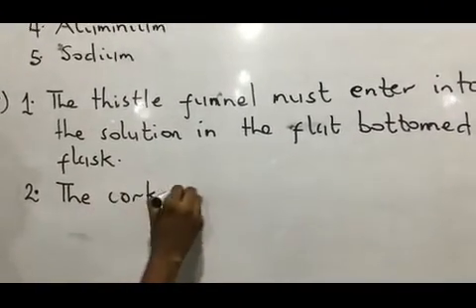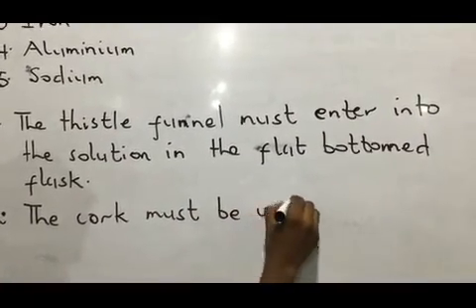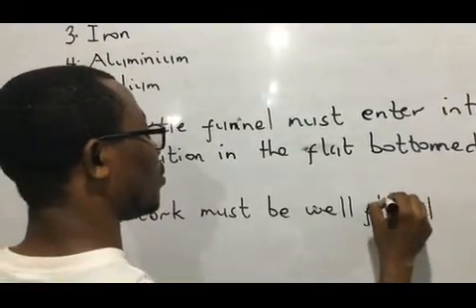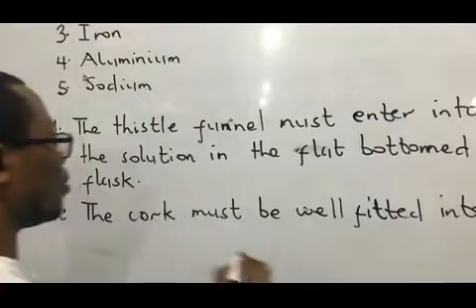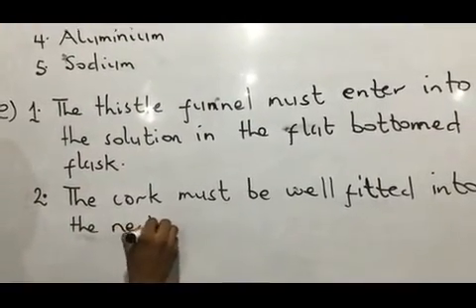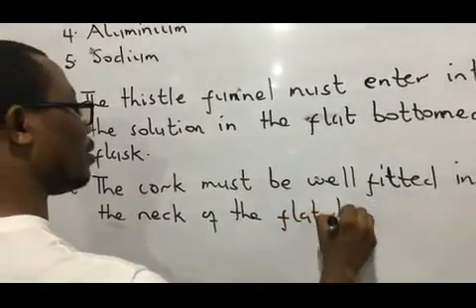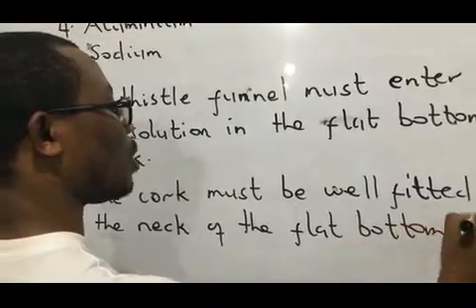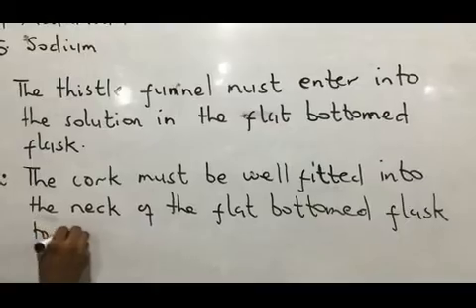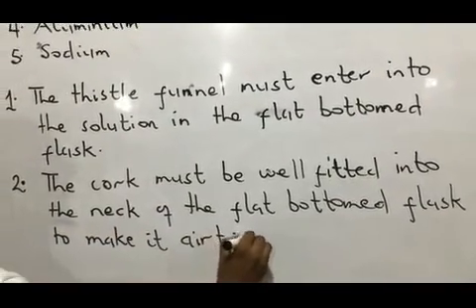The cork must be well fitted into the neck of the flat bottom flask to make it airtight.